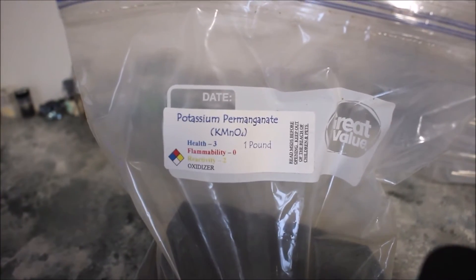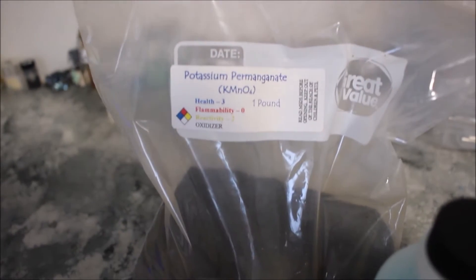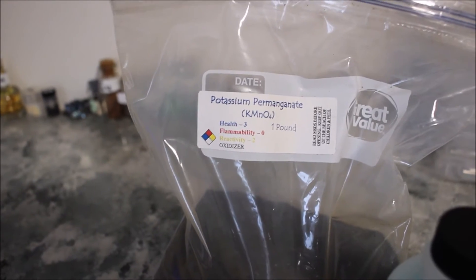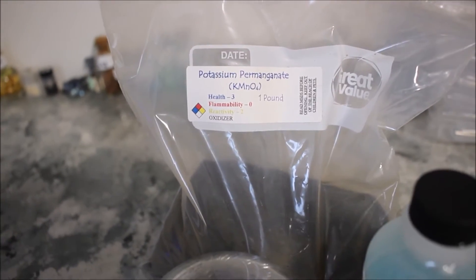Now for the chemicals — I got a pound of potassium permanganate. That's a super important oxidizer in your chemistry lab. If you want to see that in action, there's a video coming out.